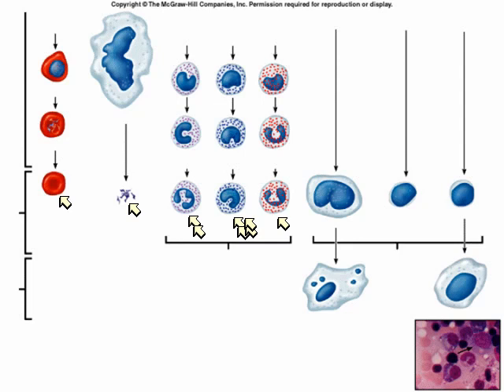It almost looks black under the microscope. So those are basophils. They also may have a lobed nucleus. And then the one on the right with the red dots on it that has 1 arrow at this moment, that one is an eosinophil. Again, it has a lobed nucleus, but it has acidic granules, and they stain a red color.